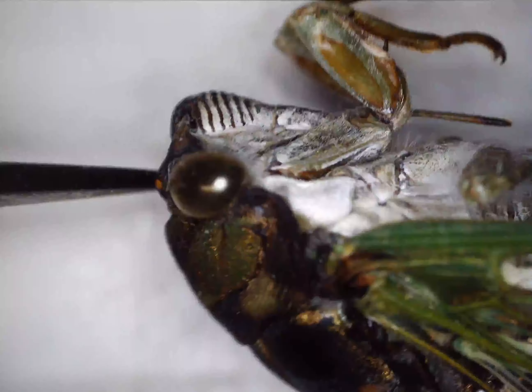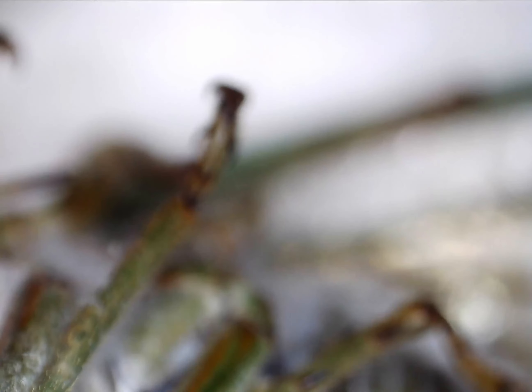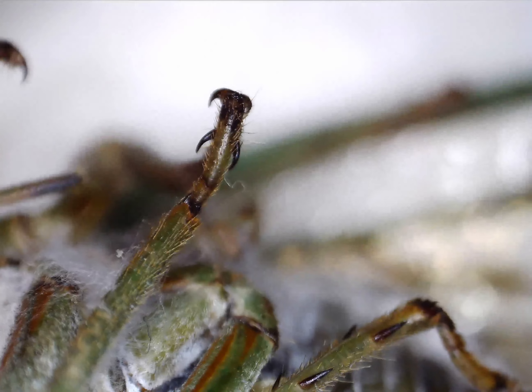I keep thinking it's closer than it is — there's a really narrow depth of field on this microscope. I have another microscope I can hook up where you can see cells and stuff, but that's not really as amusing to me. I like looking at the stuff you see every day — I like these. You can see these every day. And there are the hooks on its feet for climbing.